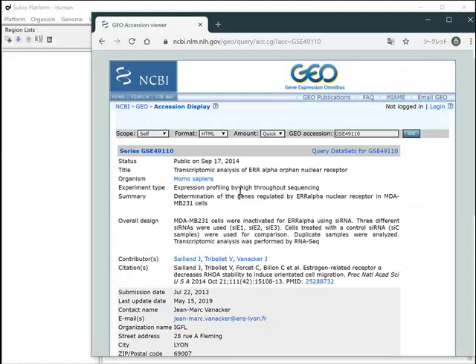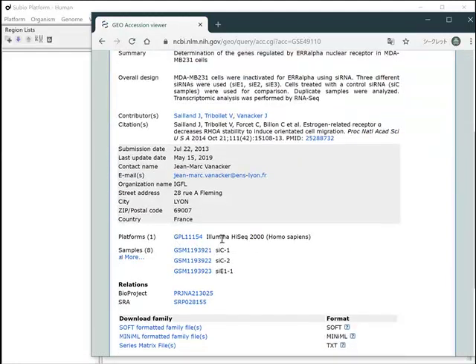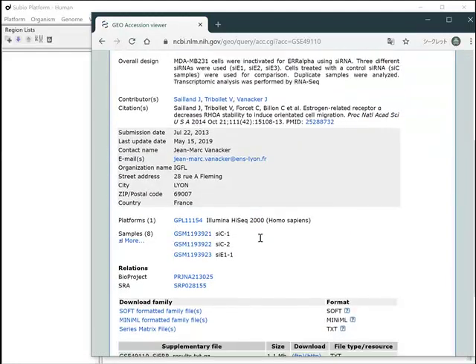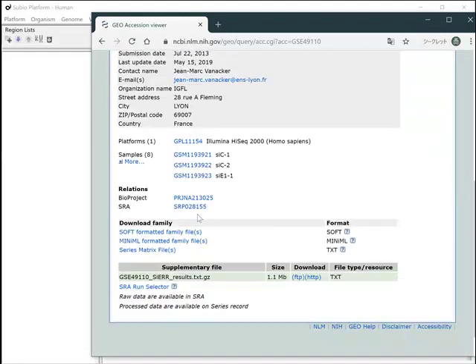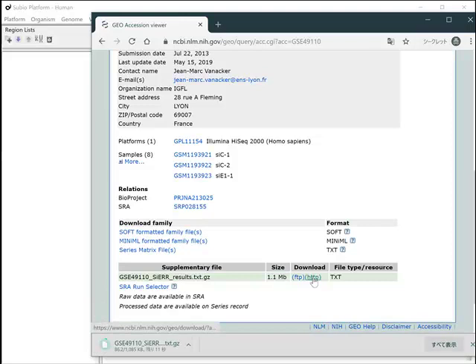You see the overview of this dataset. If you want to get the raw data, they're available from the SRA link. Here you download the table of estimated gene expression levels.